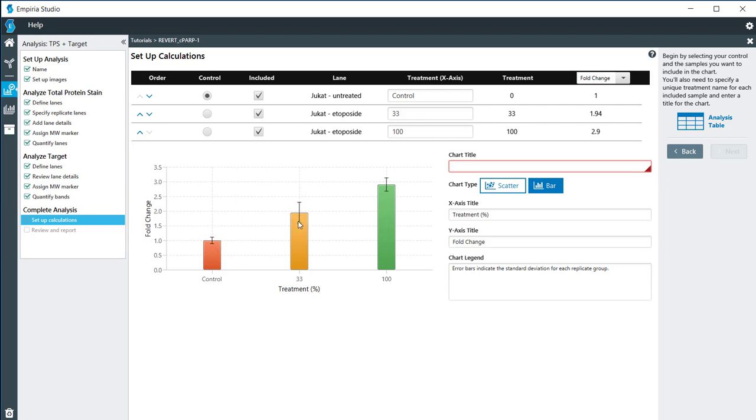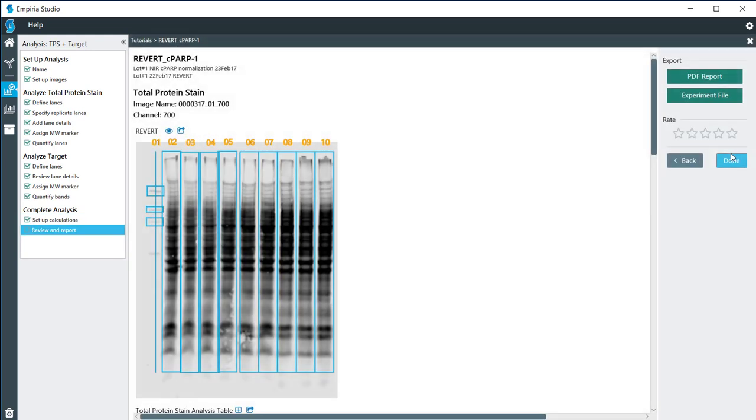In my two treatments, you can see that the fold change is shown there along with the standard deviations of the three samples for each replicate. I do need to give it a title. I'm just going to call this Fold Change and then click Next.